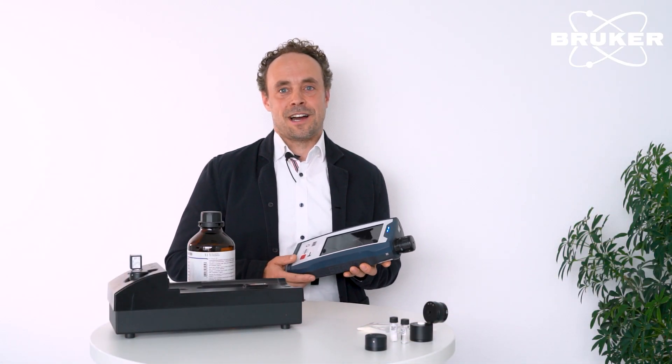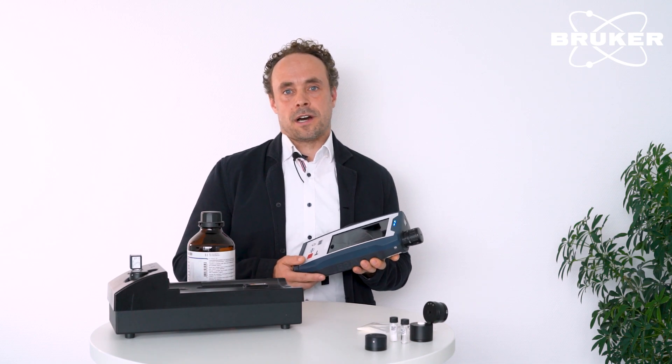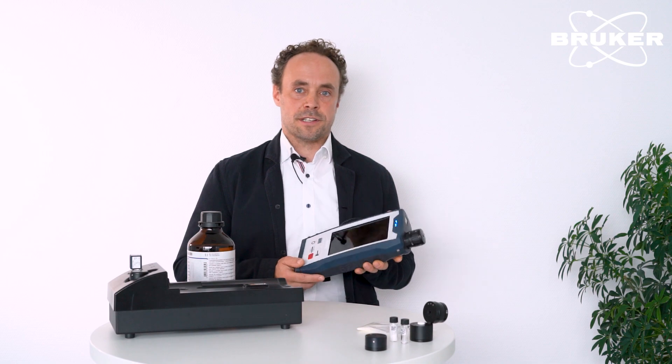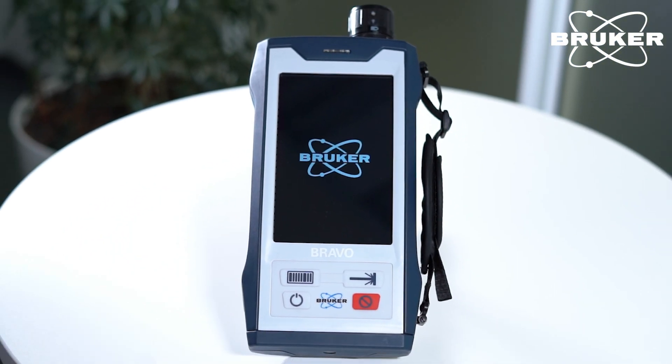Welcome. My name is Felix. I'm the product manager for the handheld Raman spectrometer Bravo and our FT-Raman series. Today I want to give you a brief presentation of our handheld Raman spectrometer, the Bravo, dedicated for pharmaceutical raw materials verification.